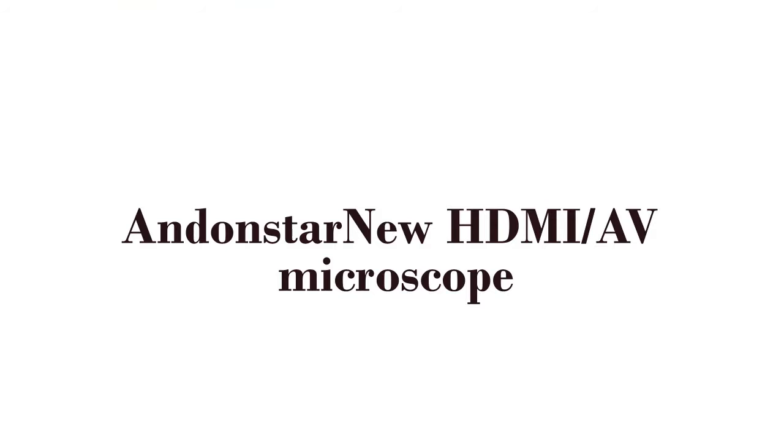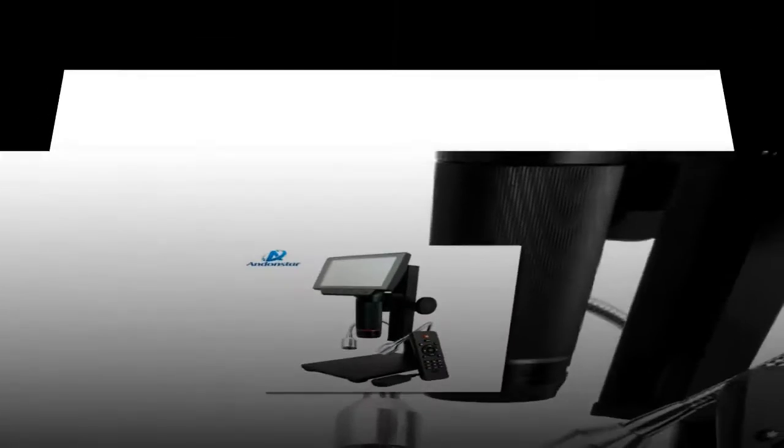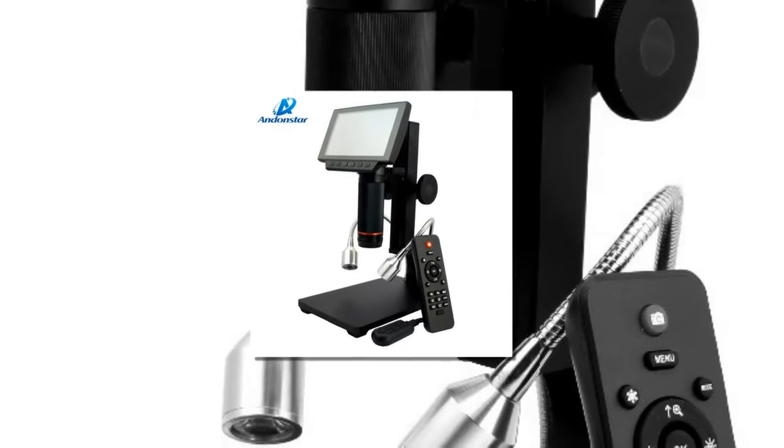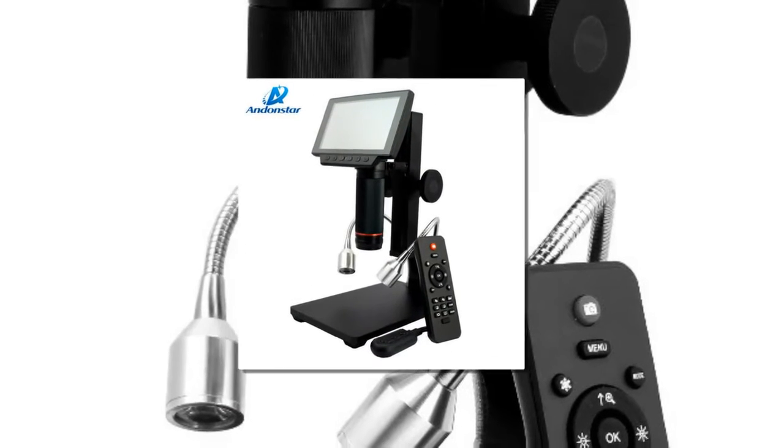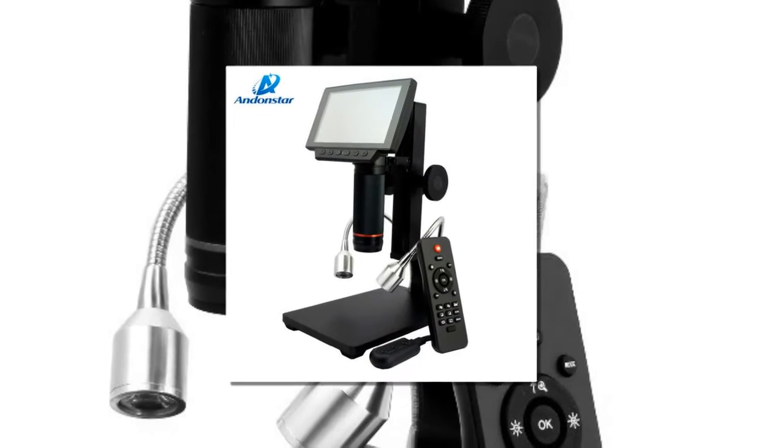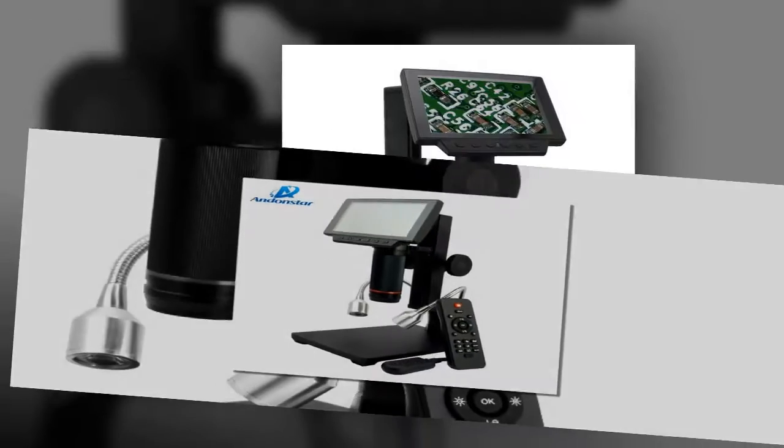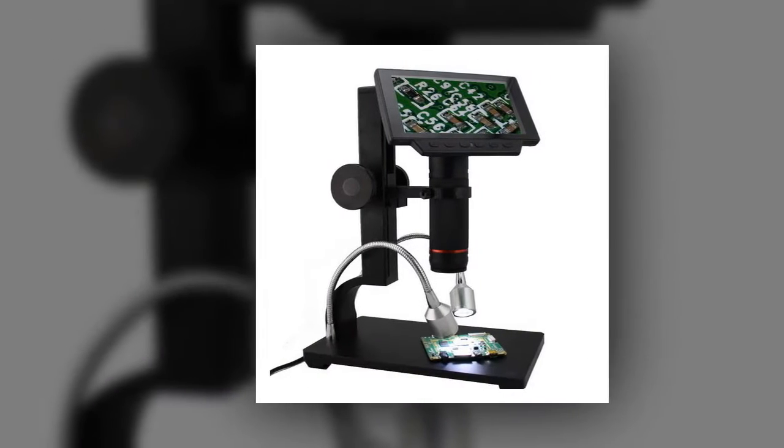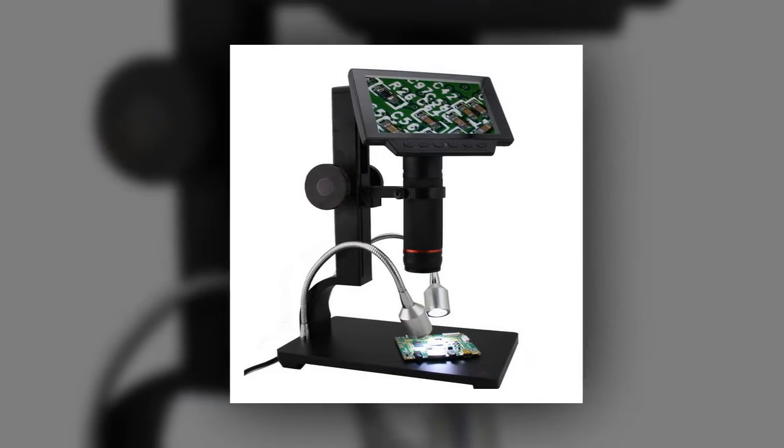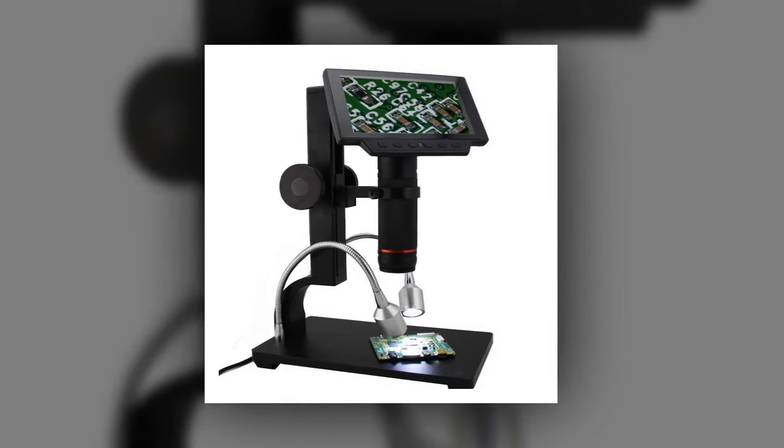Andonstar New HDMI/AV Microscope. Brand Name: Andonstar. Model Number: ADSM302.